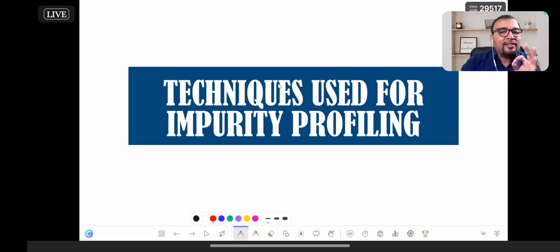Techniques used for impurity profiling. It's a very important session now. I'm going to talk about analytical techniques which are used in characterization of your different degradation products.